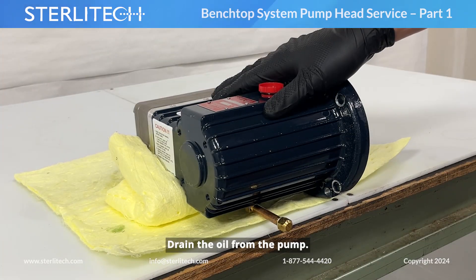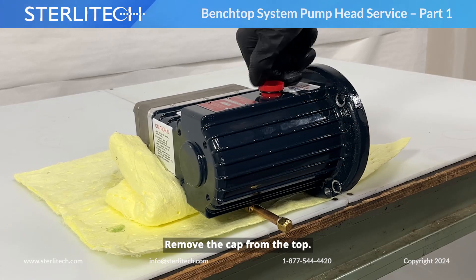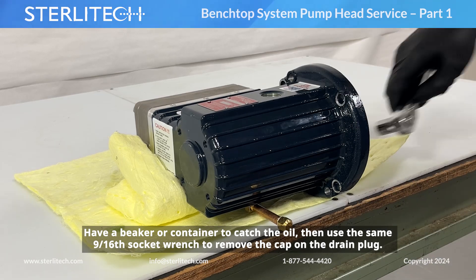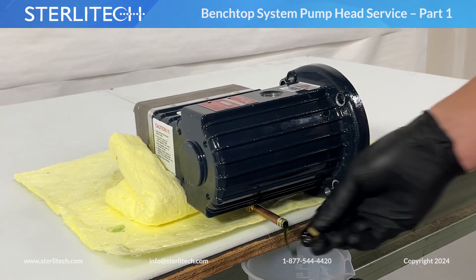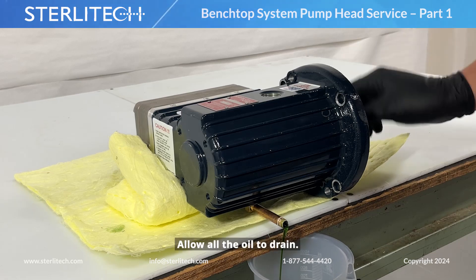Next, drain the oil from your pump. I have it propped up on the side of my table. We're going to remove the cap from the top. Have a beaker or container to catch the oil. Then use the same 9/16 socket wrench to remove the cap on the drain plug. Now allow all the oil to drain.